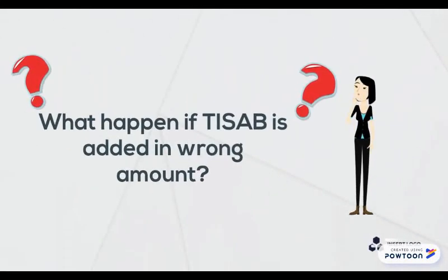So, what will happen if TISAB is added in an inappropriate amount? First, the background ionic strength will not be constant, and this will directly affect the results obtained. Besides, some ions will react with the fluoride ions to form another compound.